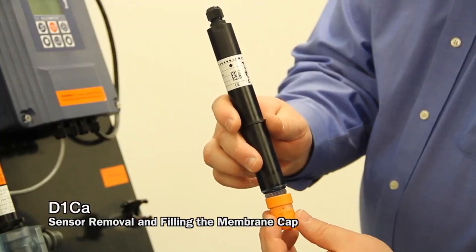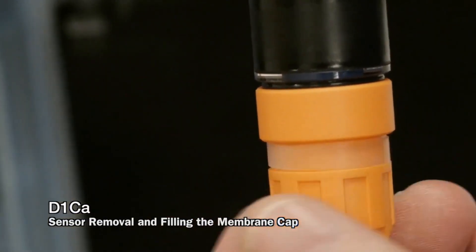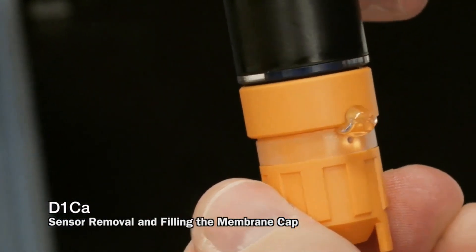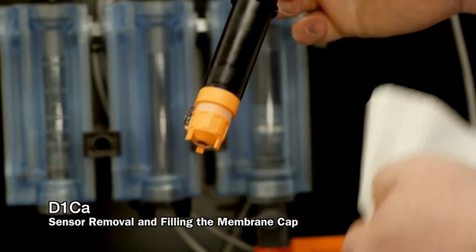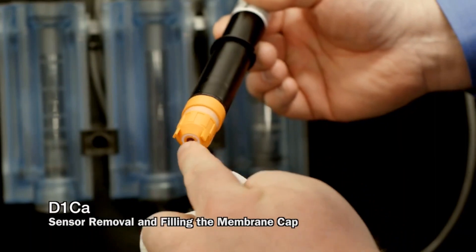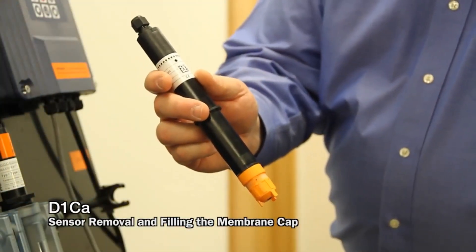Thread the sensor back on. You'll see that some electrolyte will come out. Wipe that electrolyte away, but never wipe across the membrane itself. Now you can put this sensor into flow.